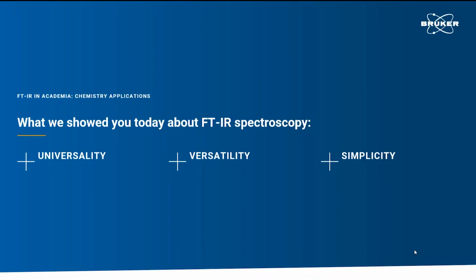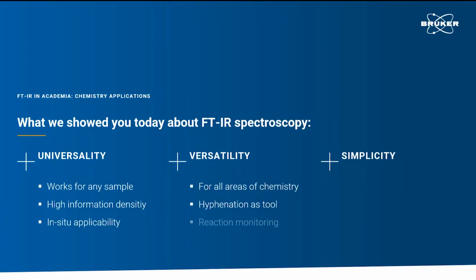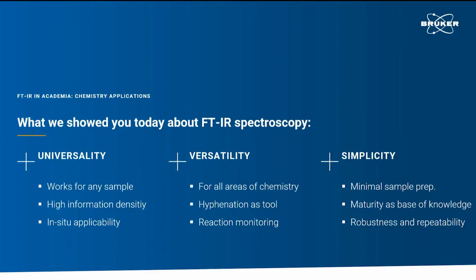Well, that were basically all examples I want to show you today. We could highlight the universality, versatility, and simplicity of FTIR spectroscopy and scratched the surface of what is possible. Your take-home message is that FTIR works for almost any sample, is applicable in situ, and has a real major base of knowledge. If you need reference data for your experiment, you're very likely to find it in the decades worth of publications that deal with the FTIR technique.